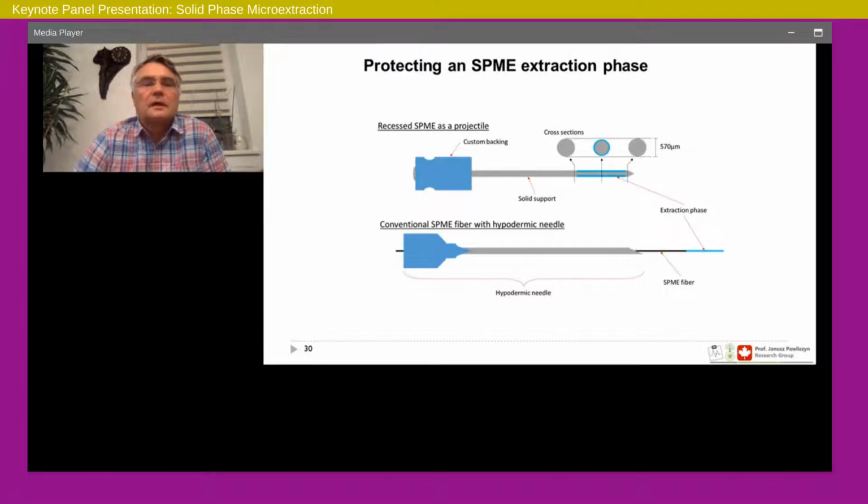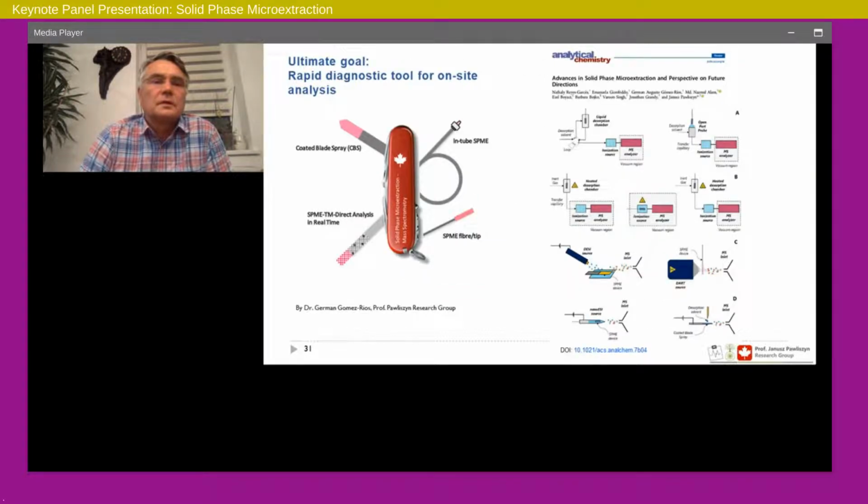And then the upper part where you actually have a coated needle, where the coating is in the recess. Because now we can make those coatings very robust, the tip penetrates the tissue, and there's not much shear force on the coating, so we can reuse this needle many times. So we think this would be the ideal medical device, and we are working with a number of surgeons and researchers involved in animal studies.